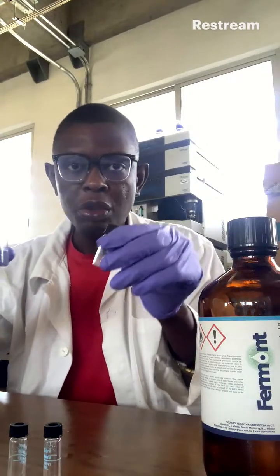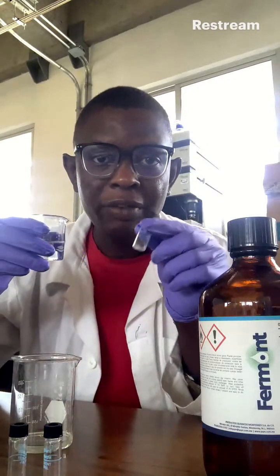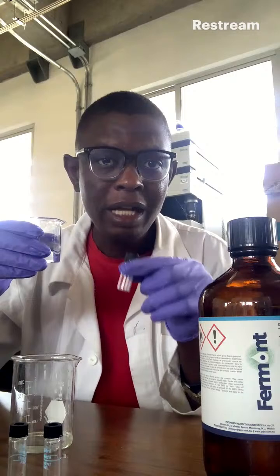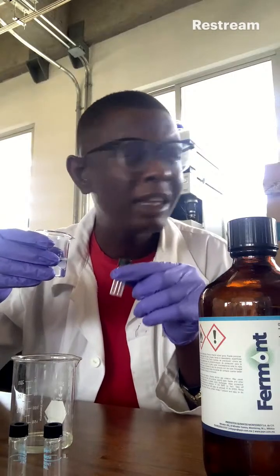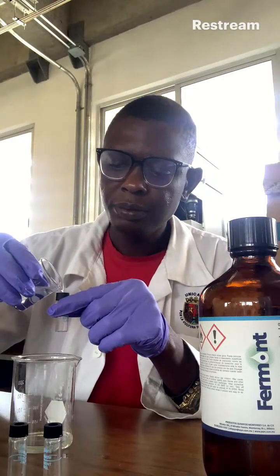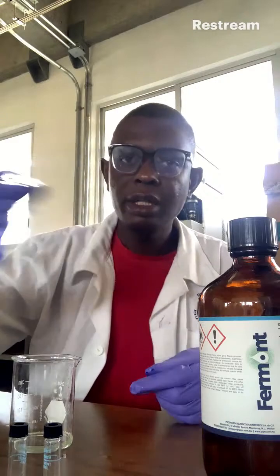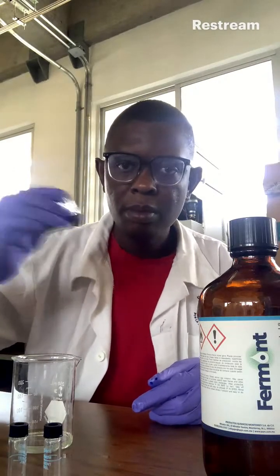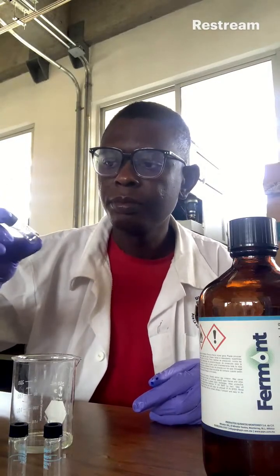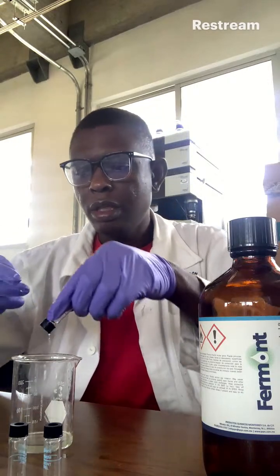So I'll first of all wash. Remember, the GC machine does not like any form of contamination. When there is a contamination, there is a high tendency to spoil all the work that you are doing. So I will wash by swirling. And then I pour it off.